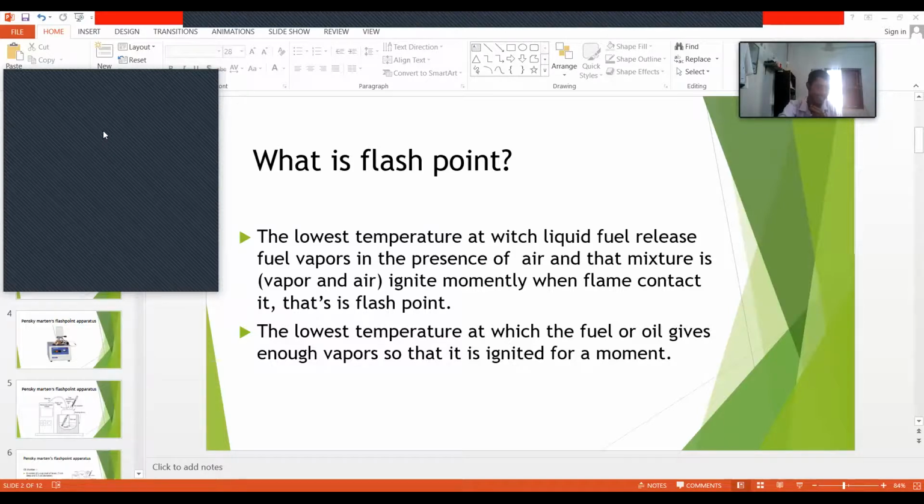Okay, tell me what is the flash point we found for the diesel fuel? Diesel 96, sir. 52 to 96. Range. Yeah, that is a range, no? But in our practical, while doing the practical, we found the flashing temperature at one temperature. I am asking for that temperature. 94. No.